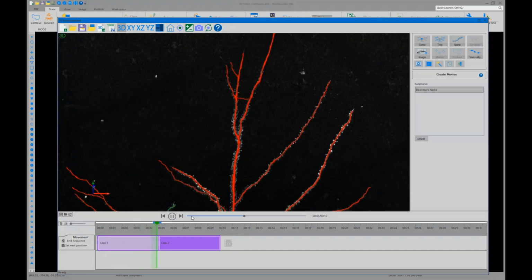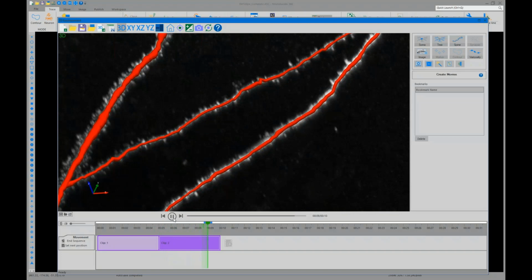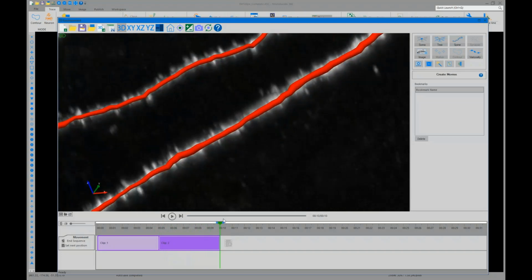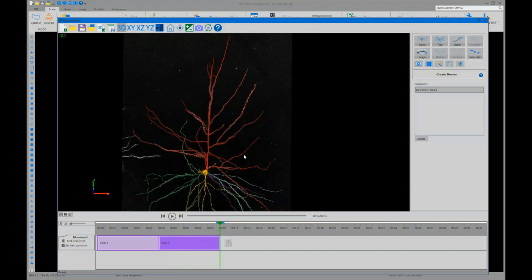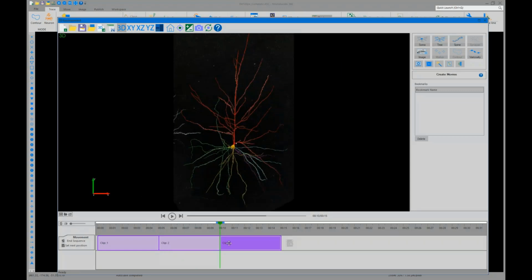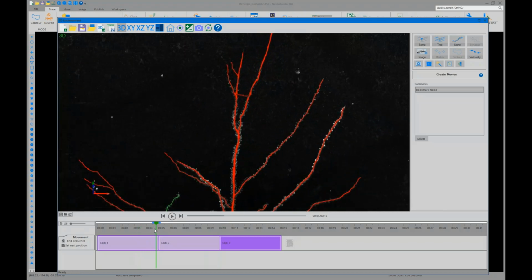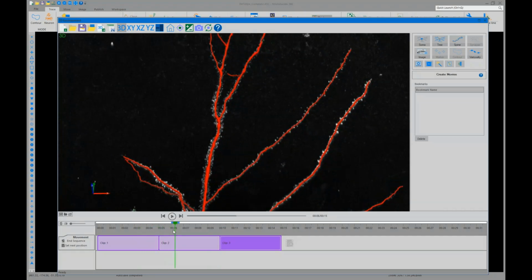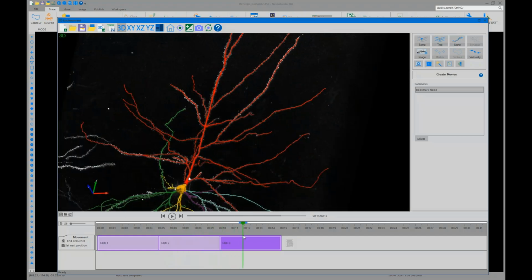Like we had mentioned before, there is going to be a delay in the image or video right now, but hopefully that will be different when we have that final video available for you. Lastly, if I click home and click the add clip button one last time, we have a full video with all of the necessary movements done, and we've only had to click the mouse 5 or 6 times.